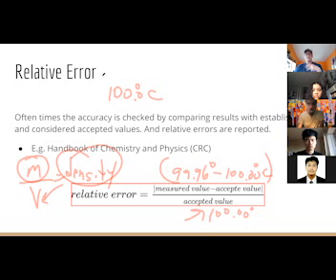So we'll have our estimate of the volume from reading the measuring instrument we're using, our own estimate with our own eyes. Then we'll calculate the actual volume by measuring the mass more precisely and using an accurate density. That's how we're going to figure out our relative error.